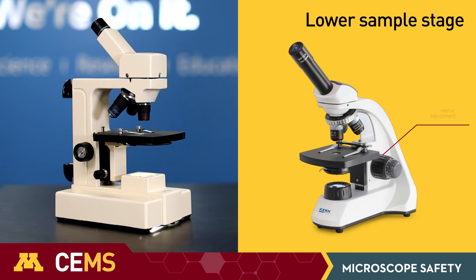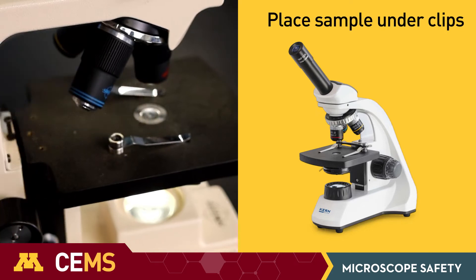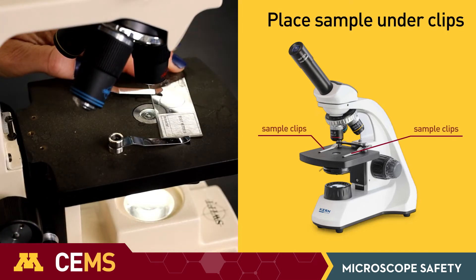Always lower the sample stage completely before placing your sample on the sample stage. Then hold the sample in place using these clips.